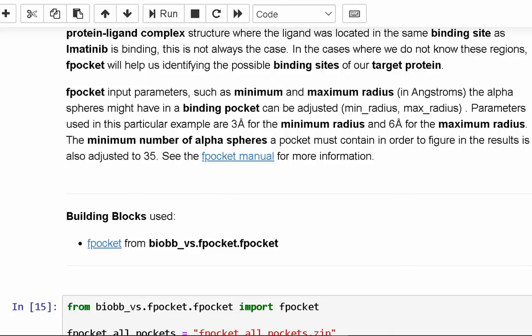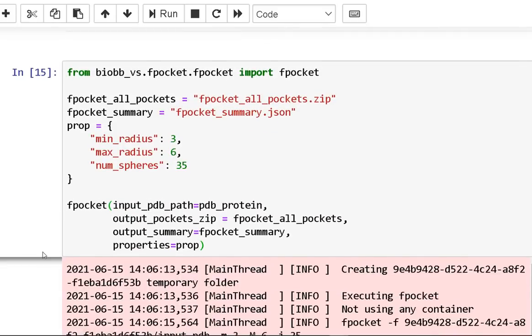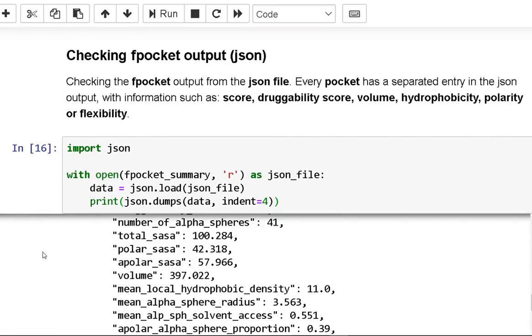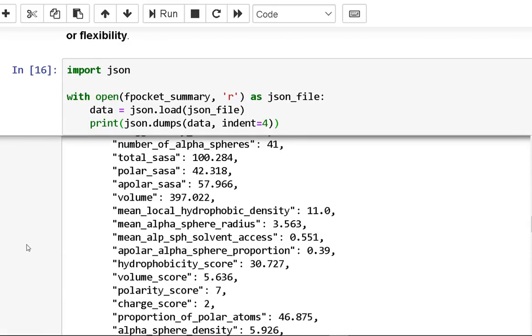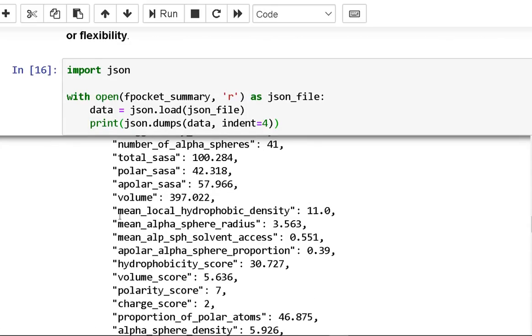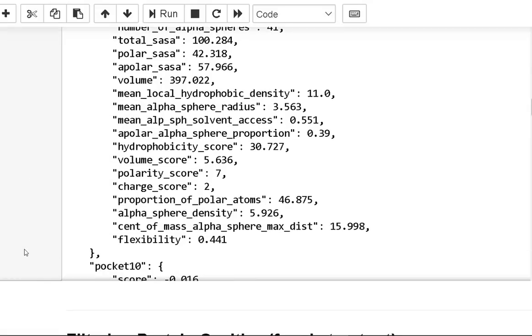Examine the JSON file's FPocket output. In the JSON output, each pocket has its own record with information such as score, drugability score, volume, hydrophobicity, polarity, and flexibility. This is used for filtering the FPocket-identified protein cavities.